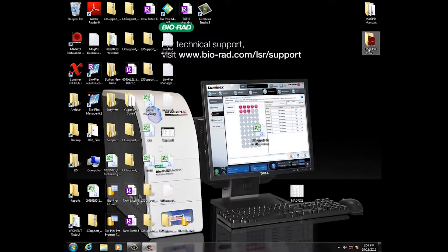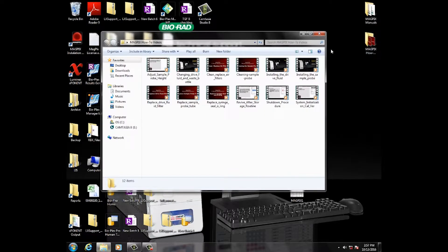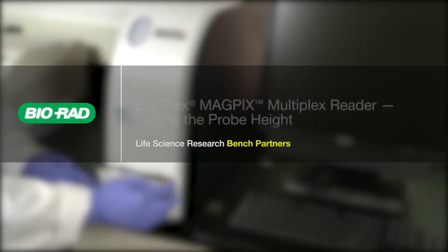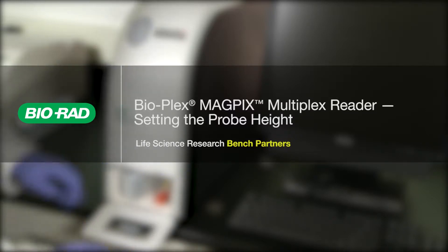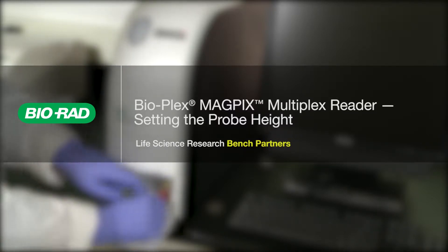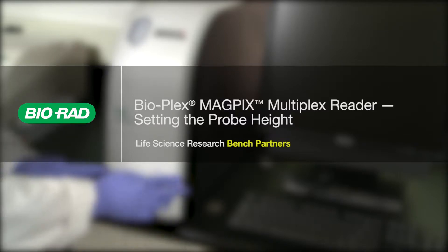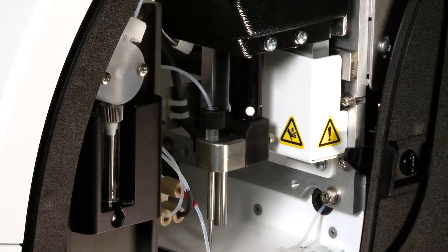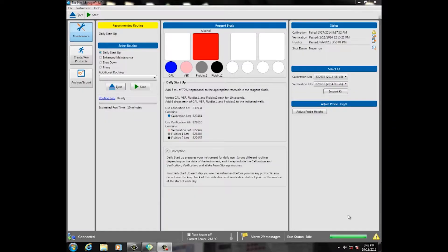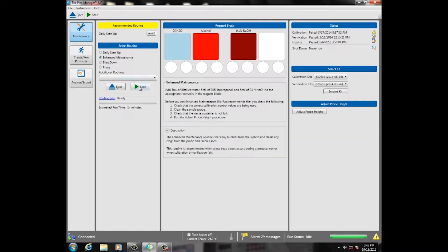Instructions for cleaning the sample probe are provided in the how-to videos that come with the instrument. For instructions on setting the probe height, refer to the setting the probe height on the BioPlex MAGPIX multiplex reader video available on the BioRad Life Sciences YouTube channel. After the sample probe has been verified, perform the pre-set enhanced maintenance routine a couple of times within the BioPlex Manager MP software.